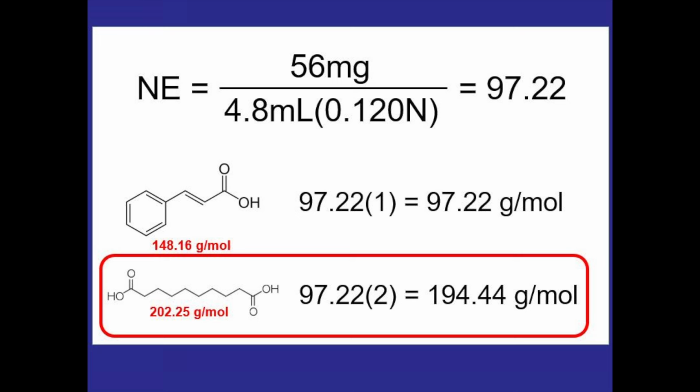From here though, deciding on which acid we actually have kind of depends on how well we feel like we did the titration versus how well we feel like we isolated a pure crystal to take an accurate melting point.